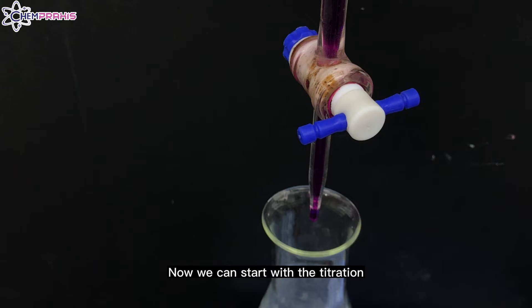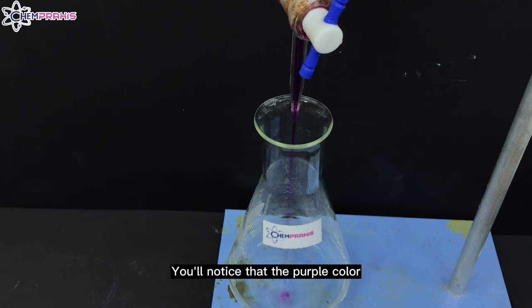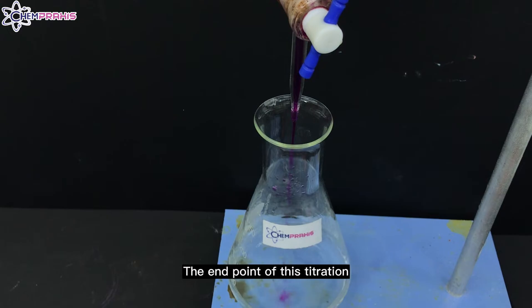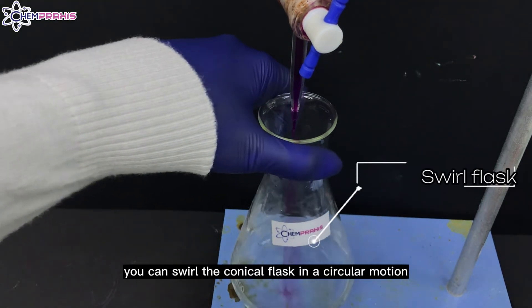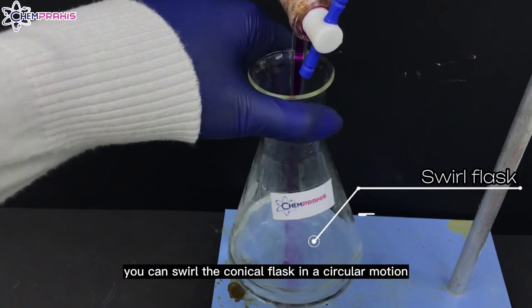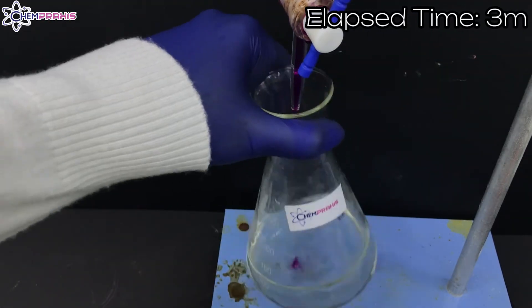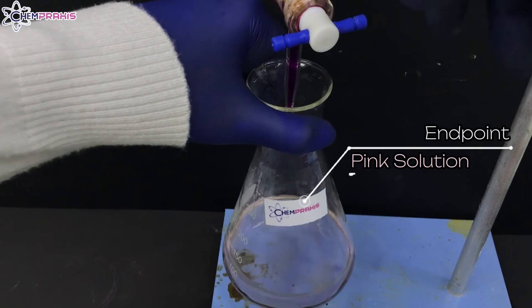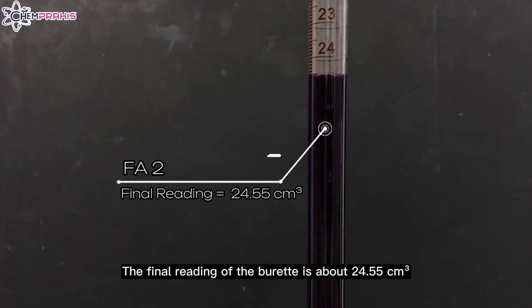Now we can start with the titration. You'll notice that the purple color of the potassium manganate solution is being decolorized. The endpoint of this titration is where the solution turns into a light permanent pink color. When doing the titration, you can swirl the conical flask in a circular motion. The endpoint is reached and you can turn off the burette. The final reading of the burette is 24.55 cm³.